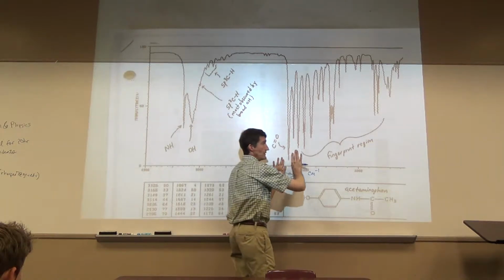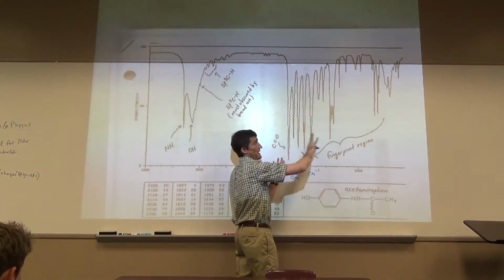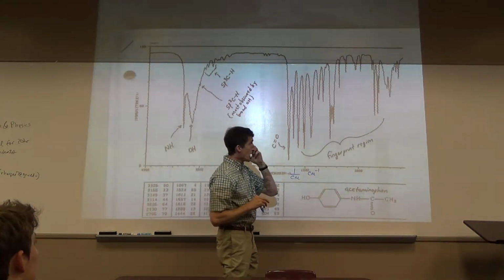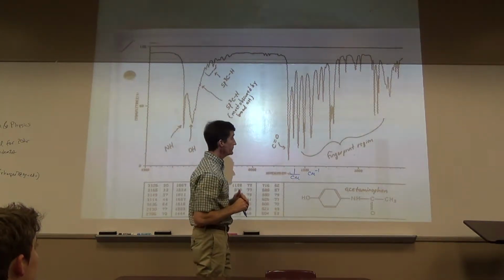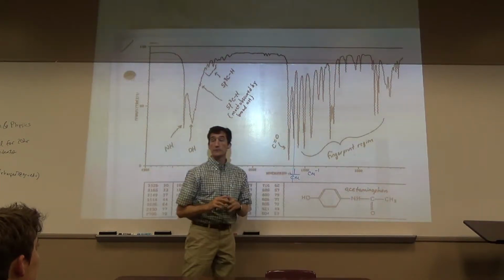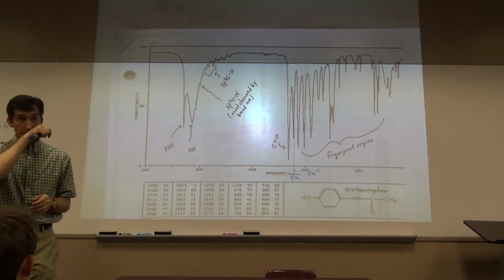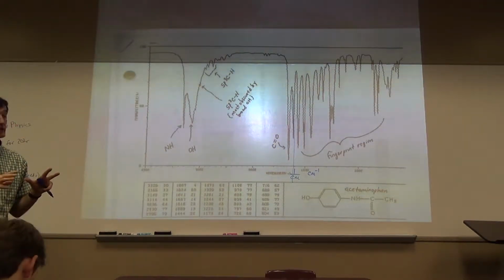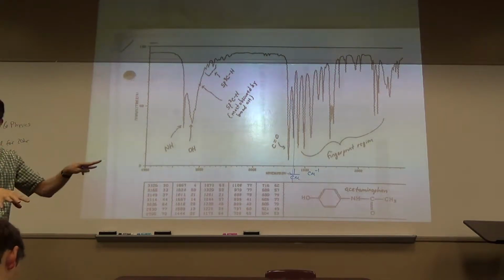We know that you typically get a lot of absorbance down here. These are hard to interpret and to assign every peak. Instead, from here down is called the fingerprint region. Lots of peaks down there, and it's used just like a fingerprint for a human. Every compound will have a unique fingerprint region, a unique appearance of the peaks.